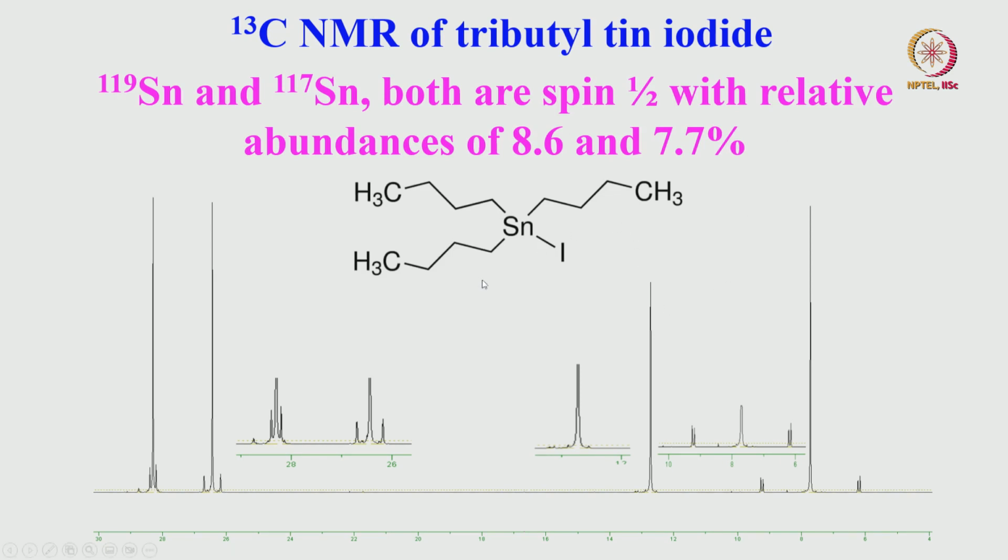And in this molecule, if you are looking at the carbon 13 spectrum of it, look at the type of spectrum you are going to get. First, of course, this is a CH3 peak, this is a CH3 group, and there is no multiplicity being shown here.